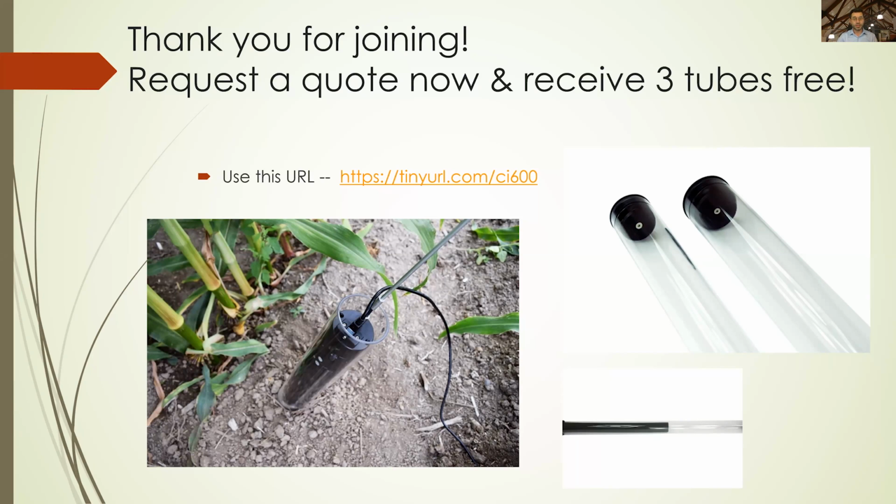So the next question is, again, how big of an area can be measured? That is simply the scanner head and dimensions. So you have 34.3 centimeters of the scanner head. You can scan that and just keep doing that for like 6 centimeters of diameter all the way through. And you can do, I would say, 2 meters very comfortably. And I've known some researchers to do more.